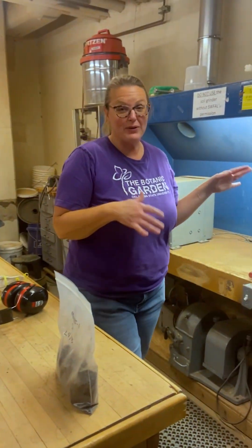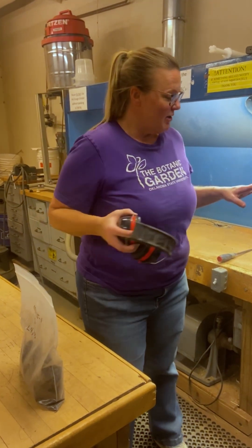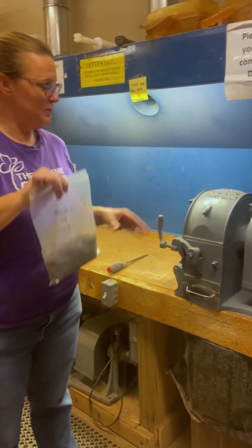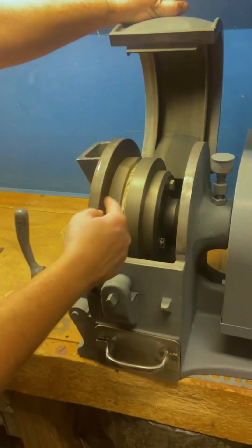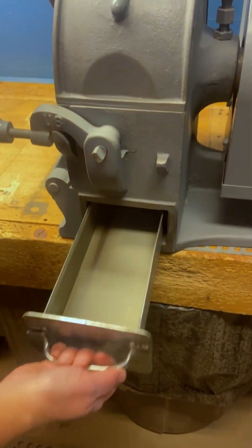I just thought I'd show you a little bit about what that process looks like. I'll put a little protection on first. What we're going to do is simply put our sample in here. It actually goes through this — these two plates grind it and then it drops down into this.